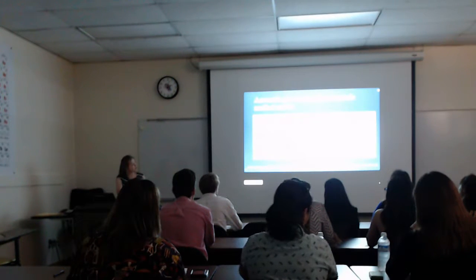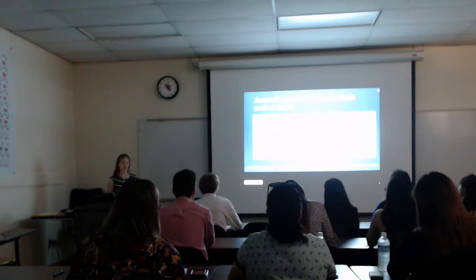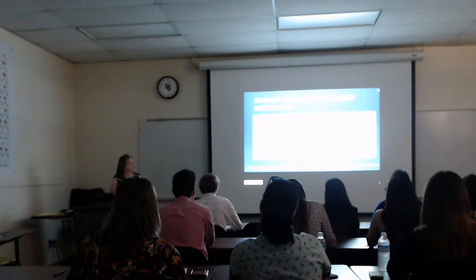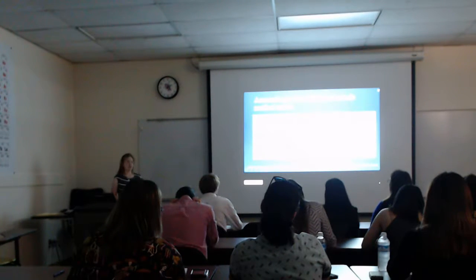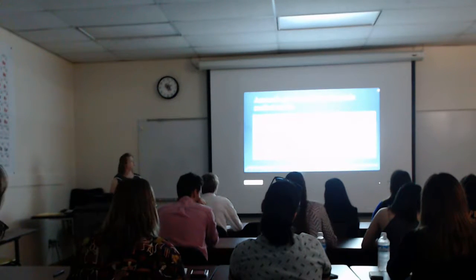As we worked with this method, we got increasingly better results. Anything under 20% was good, and because this is a natural material, we expect error. We expect about 10% error every time that we do it. Some of these work out better than others, and again, the ammonia gas electrode has many issues, including that Teflon membrane being easily damaged, and it being unnoticeable sometimes until you finish all of your trials.